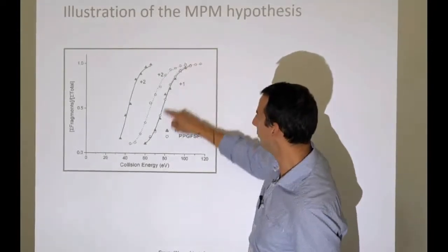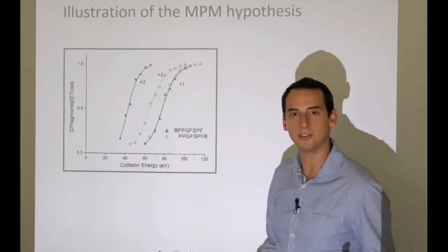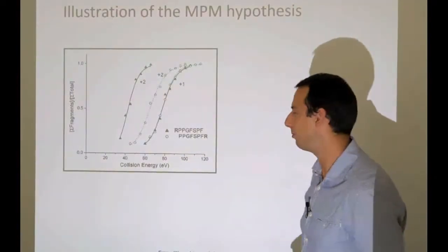By the way, these curves that you see here are the ones that we've talked about for detectors. They are sigmoid curves. They don't just show up in detectors.